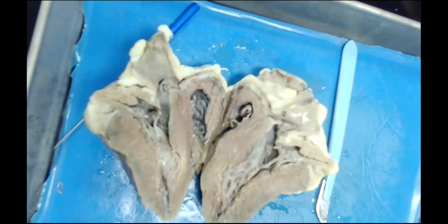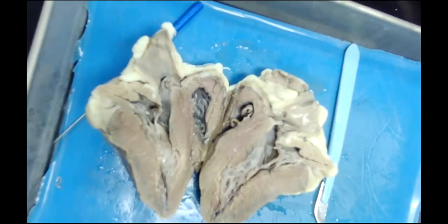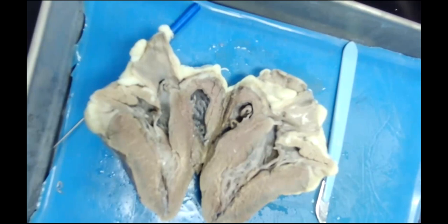I make no promises because sometimes, like I said, these preservatives can make things not quite as easy to see as on the real models, and this is not necessarily a super well preserved tissue. Well, I guess I will take your silence as golden.